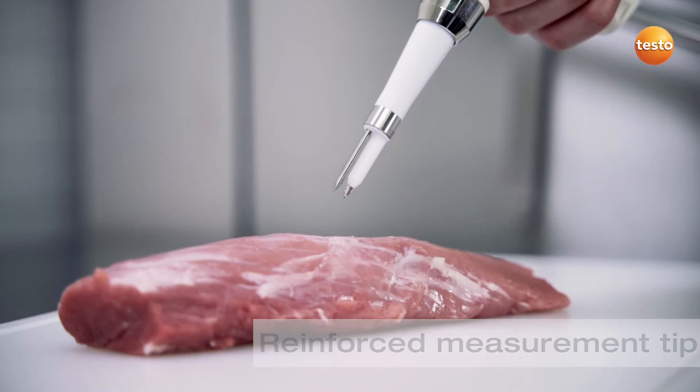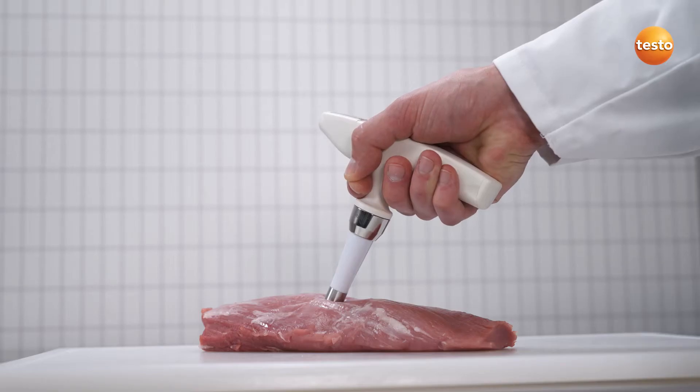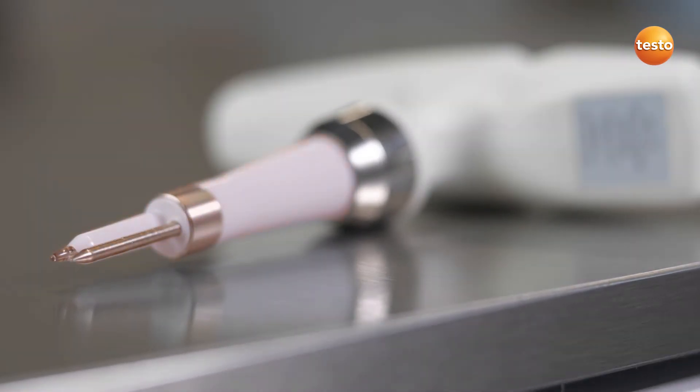Thanks to its specially reinforced measurement tip, you can also comfortably measure in semi-solid media such as meat. The combi probe can be exchanged easily, quickly and without the need for tools.